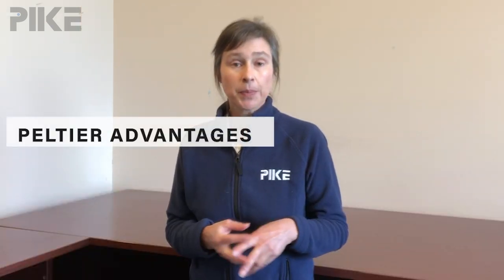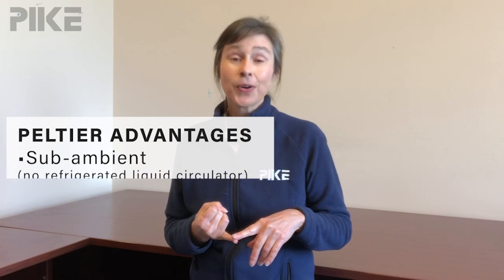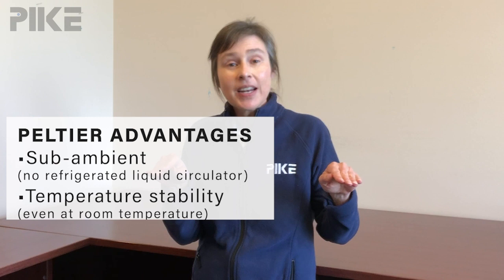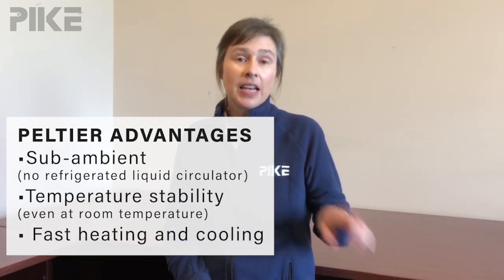Peltier elements incorporated into an IR sampling accessory have some real advantages. First, we can measure subambient without the need for a refrigerated circulator. Second, we can hold the temperature really steady right at room temperature. And third, we have fast heating and cooling rates.